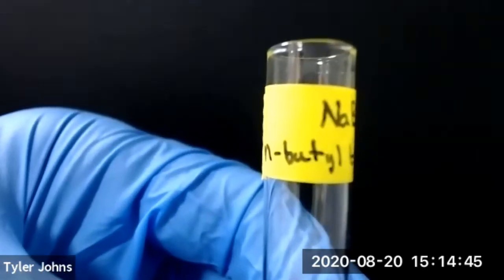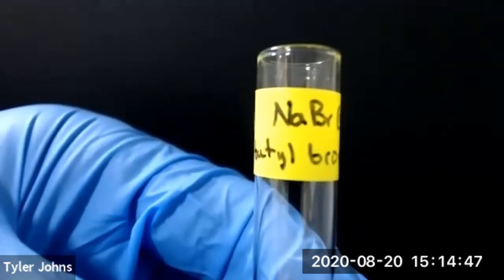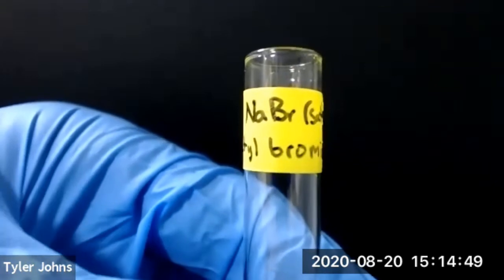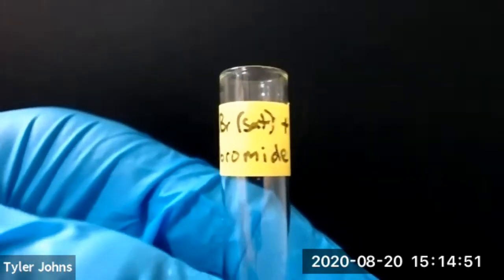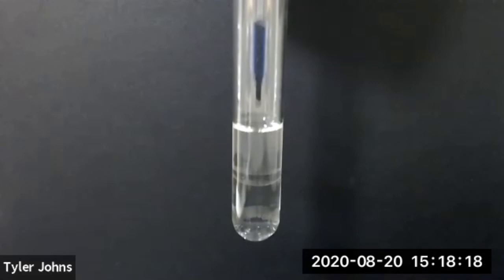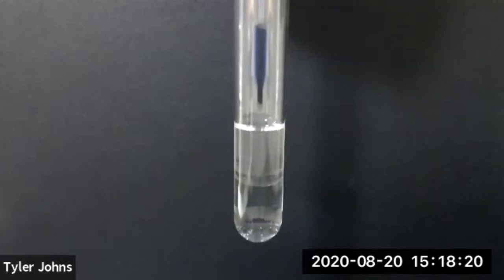Our third test tube contains N-butyl bromide and saturated aqueous sodium bromide. We'll now add several drops of water to our saturated aqueous sodium bromide and N-butyl bromide.